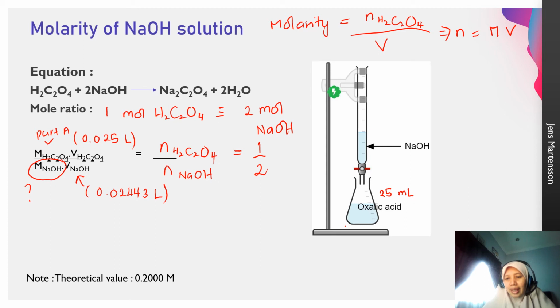Okay, I mentioned that the last number is either 0 or 5, but when we calculate the average, it can be any number, because it comes from the calculation, not from the reading itself.